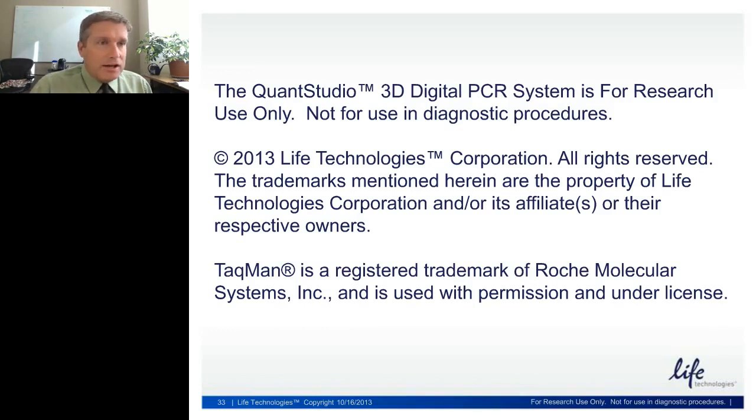Life Technologies is coming out with a calculator, I can't tell exactly when it's going to be available, which our customers can use to facilitate that calculation if you don't remember your biochemistry or molecular biology, and sometimes I don't either. This calculator should be helpful for those who need to make that calculation, and it provides a ballpark dilution to start from to make sure that you're at the sweet spot for accurate quantification.